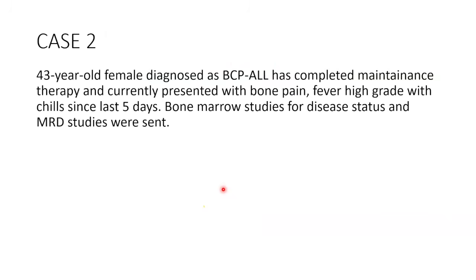So this is a case of a 43-year-old female who was a diagnosed case of B-ALL and has completed maintenance therapy. Currently has presented with bone pain, high-grade fever, and chills since last 5 days. So basically, the patient has completed all the treatment, but now the patient has presented with bone pain, high-grade fever with chills since last 5 days. So bone marrow studies were done for disease assessment and MRD studies.